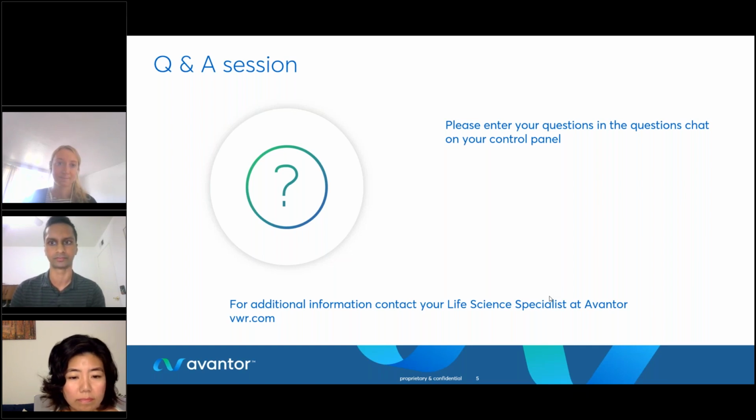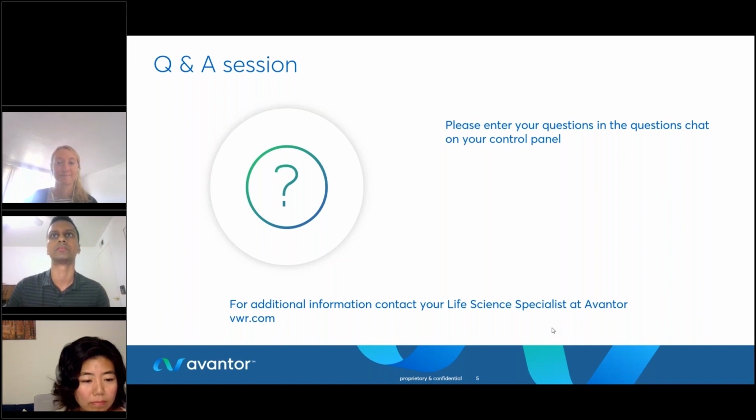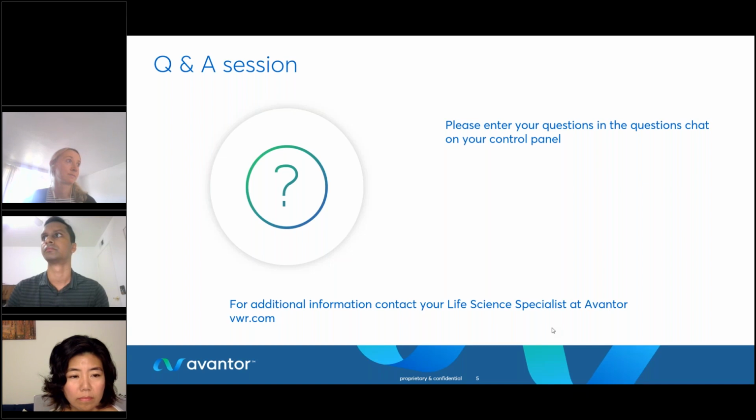Great, thank you. Let's go to the next question. Can I use this method to determine the complexity of a phage display library during my selection rounds? Obviously, the diversity is limited to a very short proportion of the plasmids, that is the single-stranded phage genome. Aaron, would you like to take this one? Can this be used to analyze phage display libraries?